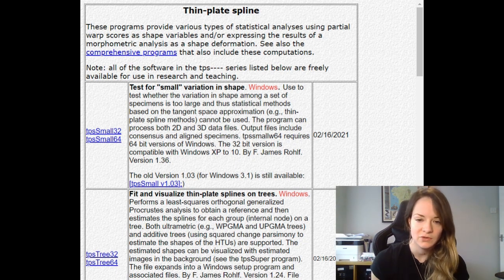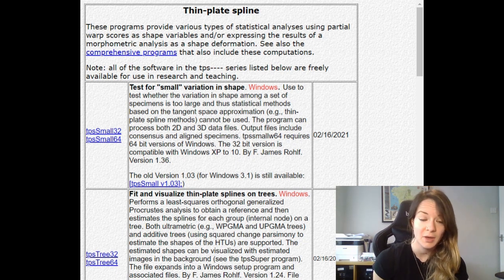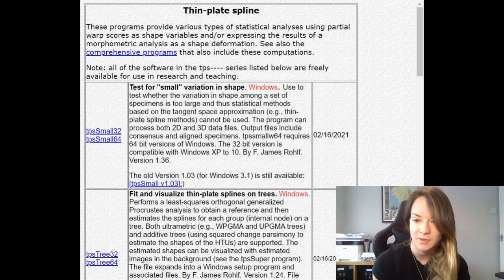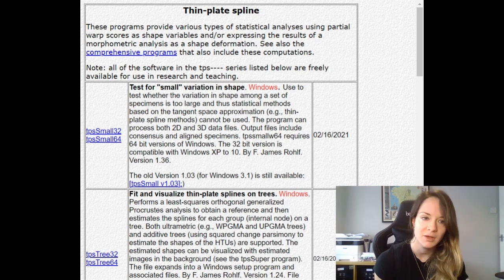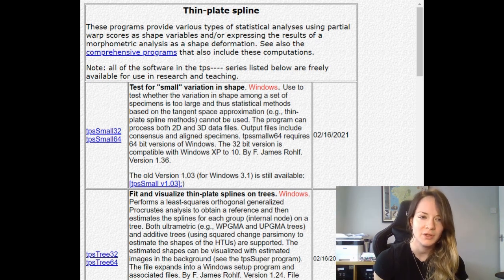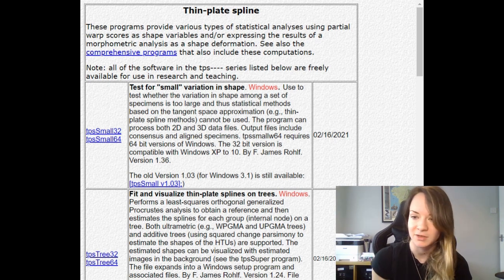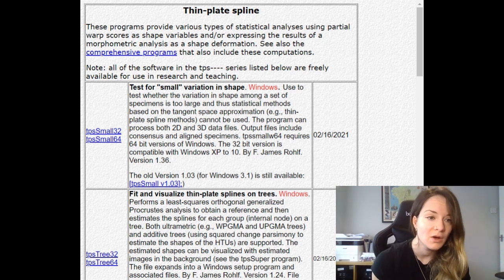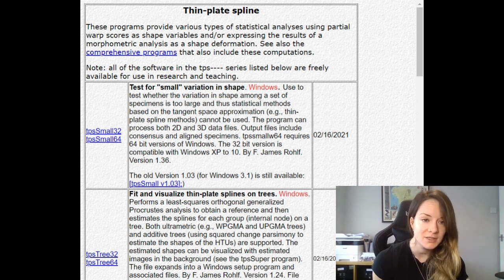So today we're going to be looking at different software, also part of the TPS suite of software. TPS-REL-W is another computer program used for performing geometric morphometric analysis on specimens.